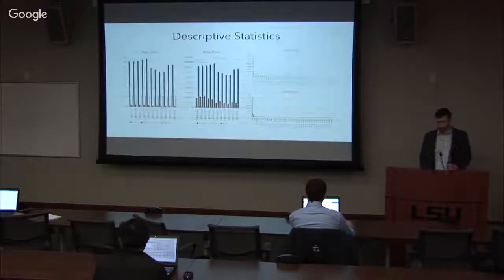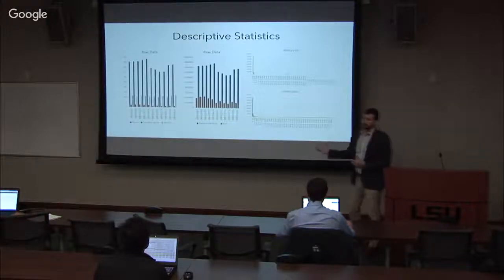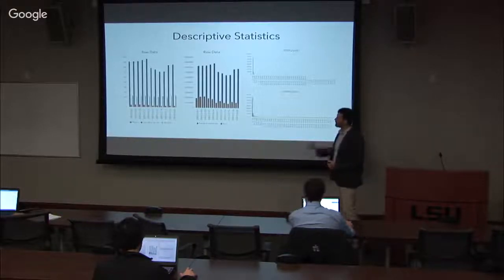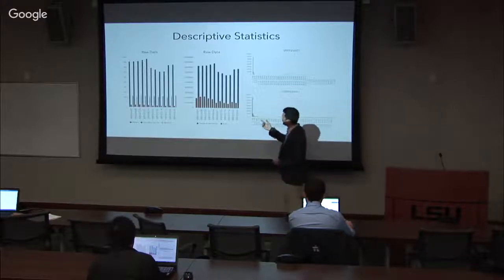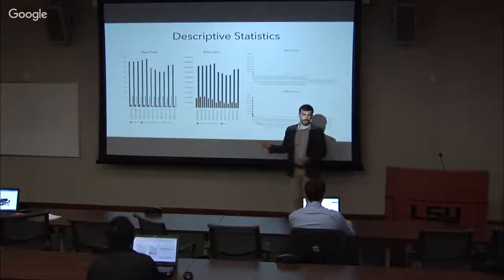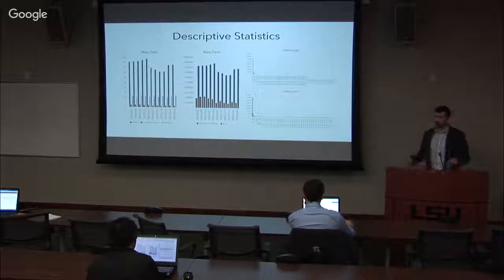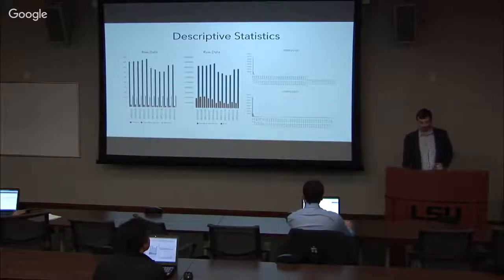And if we visually plot this information, we will actually see that there is a difference between the two groups of samples, right? So as you can see over here, it appears that in normal-like samples, the mean is higher. You can also see on this side that the sum is higher and the sample variance is higher. And what is important about this is right now we don't know why, right? So what we want to discover is how to normalize, but also why do we see this difference and whether it represents some biologically meaningful data point or not.